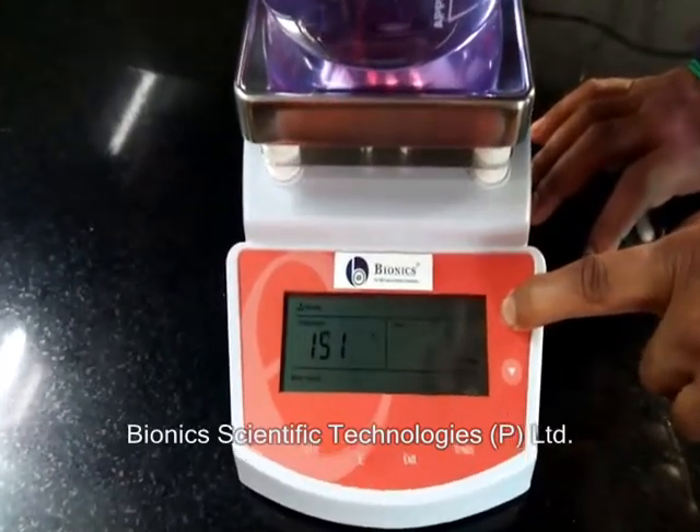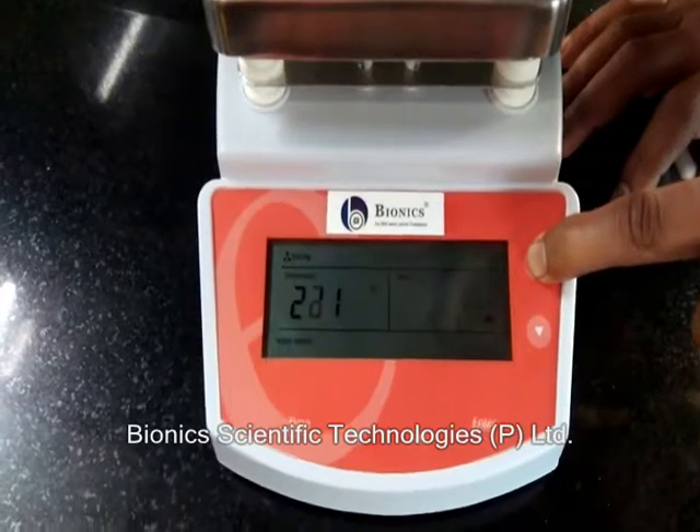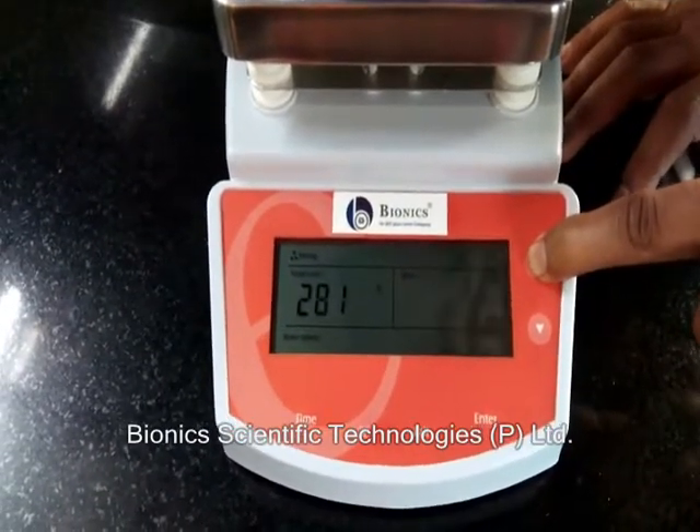We can keep it up to 200 degrees or up to 400 degrees, whatever you want. The maximum temperature of this hot plate is 400 degrees Celsius.